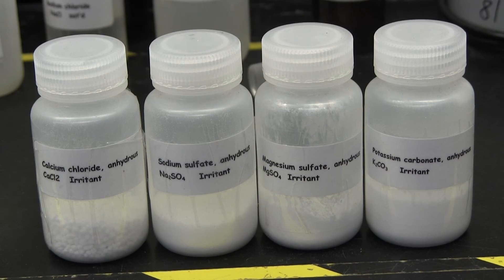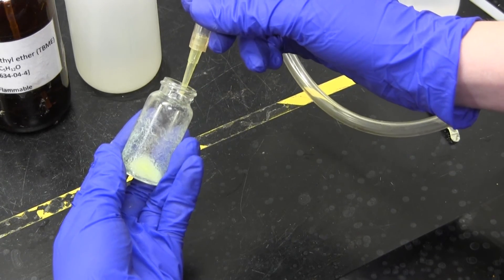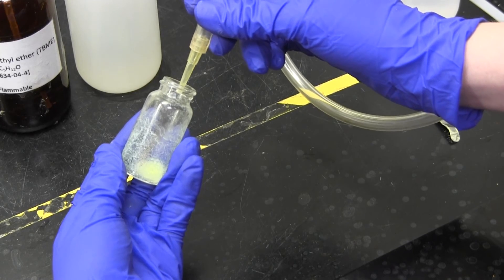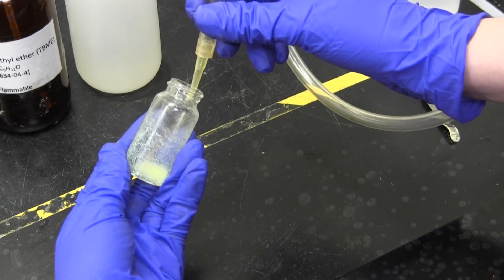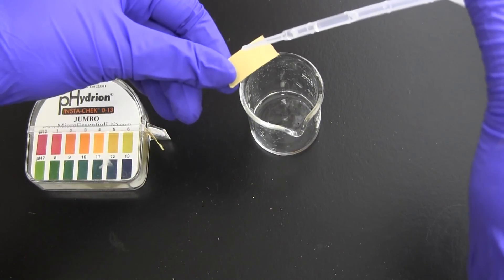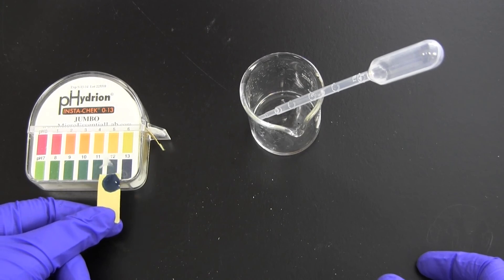Remember to remove traces of dissolved moisture from your TBME layer with a drying agent. Then you will evaporate the organic layer to isolate the neutral compound. Make sure to neutralize the compound in your water layer and extract it with some fresh TBME. Then dry it and evaporate it down. If you aren't sure how much acid or base to add, you can check with pH paper to make sure you have changed your water layer from acidic (a low pH) to basic (a high pH), or vice versa.